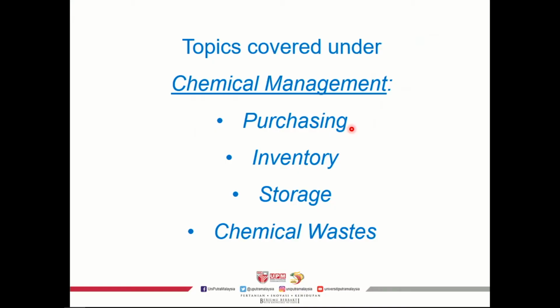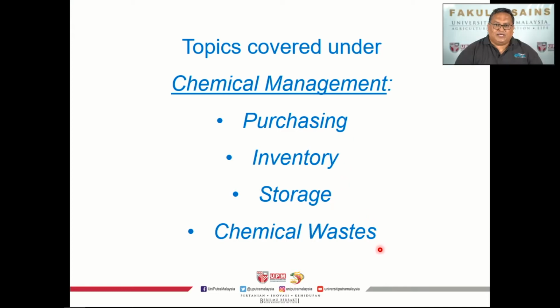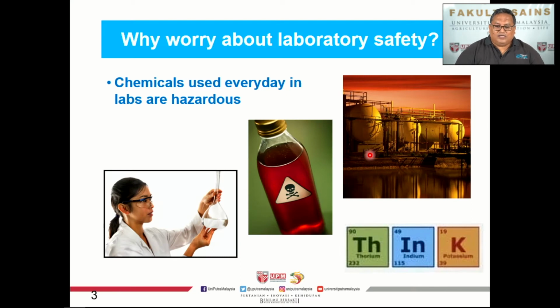Okay, so today's topic is going to be on chemical management, and hopefully I'll be able to cover purchasing, inventory, storage, and chemical waste. So, as a recap before we move on, I want to talk about why we should be worried about laboratory safety.